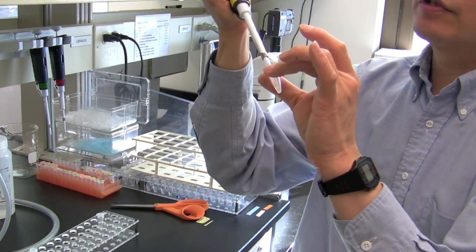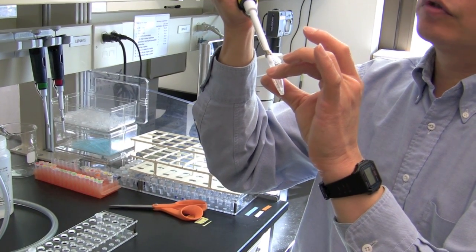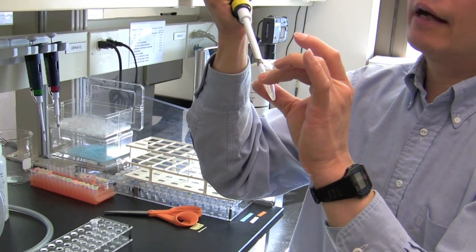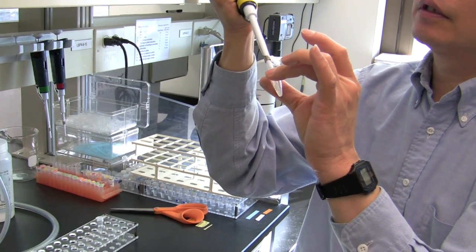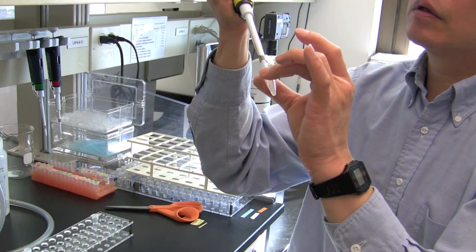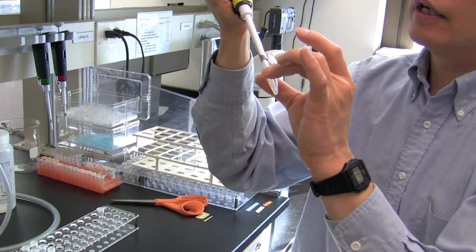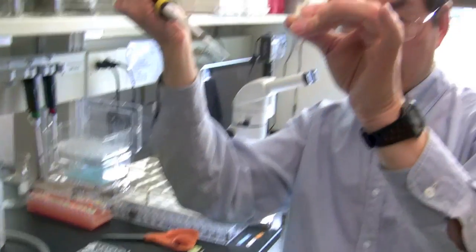If you know what you're doing with this step, it should only take a few seconds, 20 seconds to dissolve each pellet. If you try and do it through a narrow tip, it could take minutes to actually get it to resuspend. Now, sometimes you'll have a bigger pellet and it takes a little bit longer to get it to resuspend. And you might have a little bit left over in the tip, but that's sort of what you're looking for.